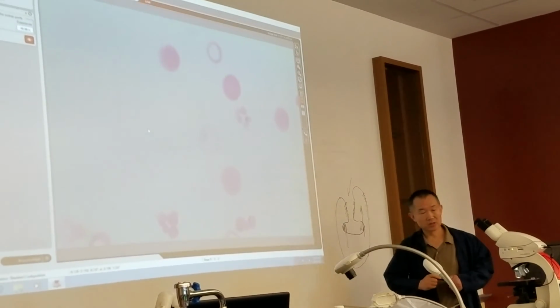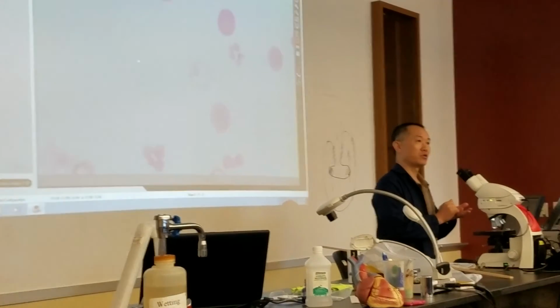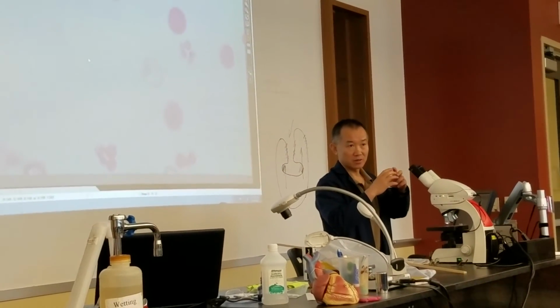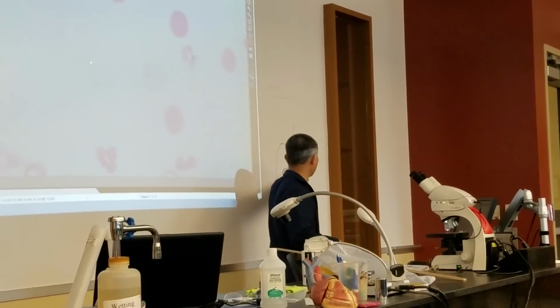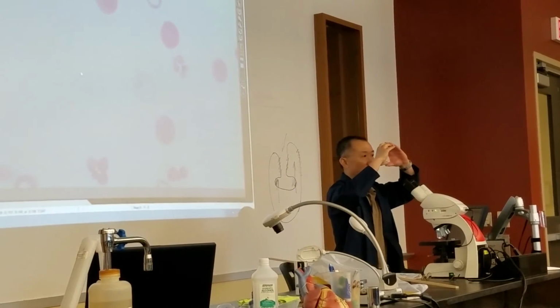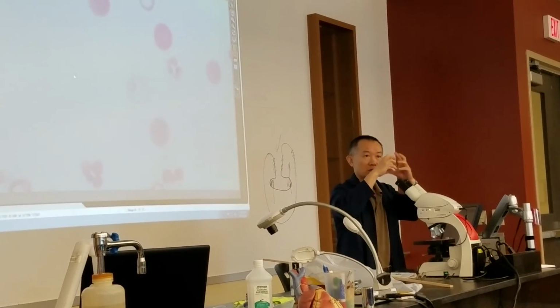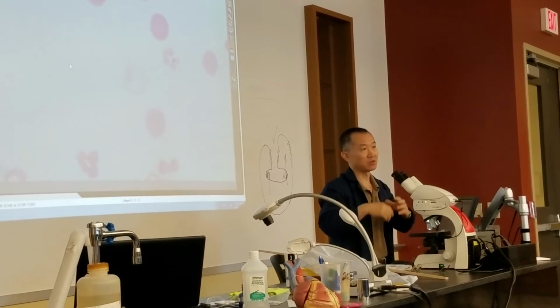Uh-huh. So for the embryo, as I told you, you need to know what is the morula and the blastula. You need to know the egg, like I showed you, one cell that has a nucleus in it. You need to know what is the gastrula. This is gastrula, invaginated from that structure. Blastula is just a ball that has empty space. Without the hollow space, a cell form a ball, that's the morula. That's how you tell them.